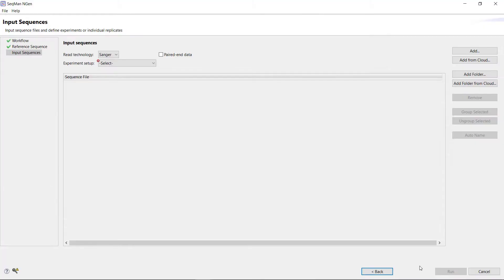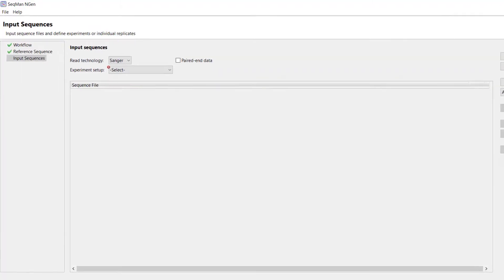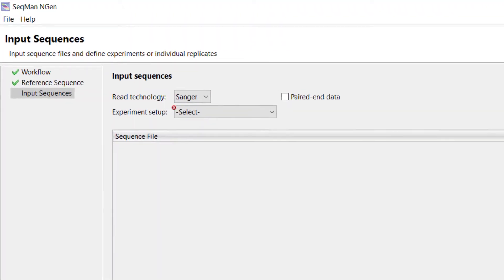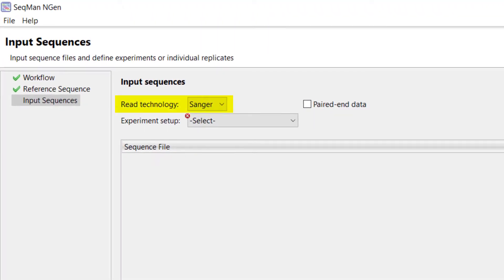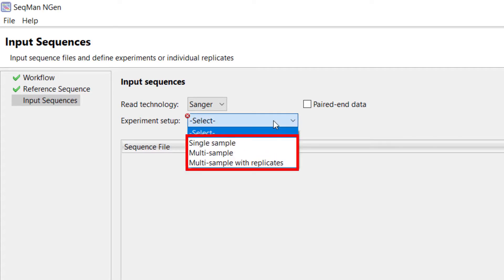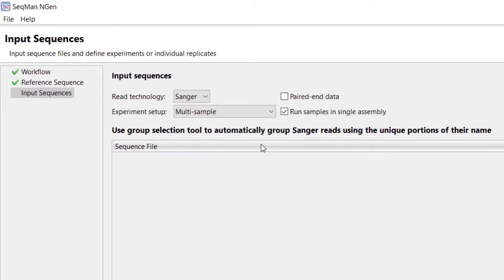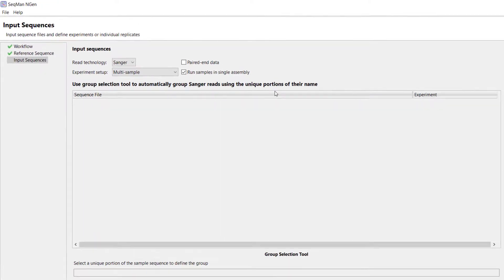Next, on the Input Sequences screen, I'm going to leave the read technology as Sanger. SeekMan Engine allows you to perform analysis on one or more samples. For this example, I will select Multi-Sample with No Replicates in the Experiment Setup menu.